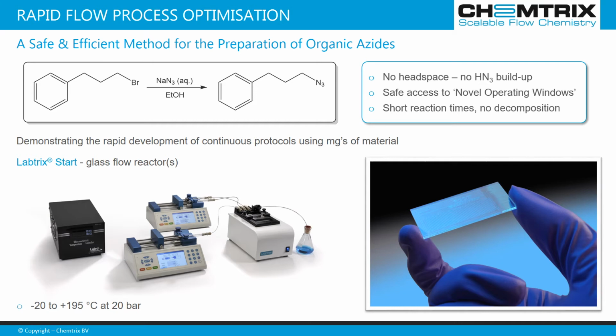So from a synthetic perspective, performing synthesis of azides under continuous flow has a number of benefits. Safety is critical. So the process has no headspace in a flow reactor, and this means you've got no risk of hydrazoic acid buildup. So this increases the safety profile of performing these reactions at scale.